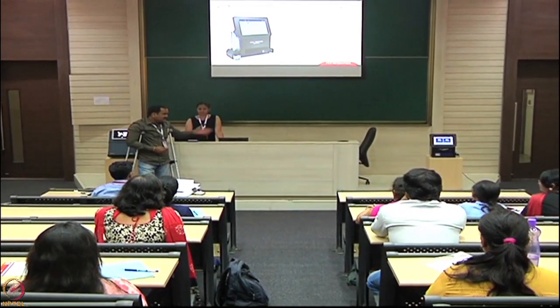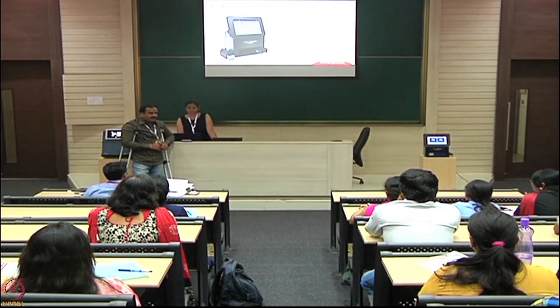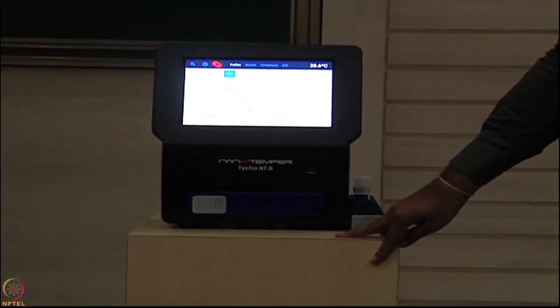Maybe 3 minutes, as I said. She will load one sample quickly. By the time she comes here, the time will be done there. So you just load one sample, it's fine. We are showing the previous data just to get an understanding, because we had only one BSA.